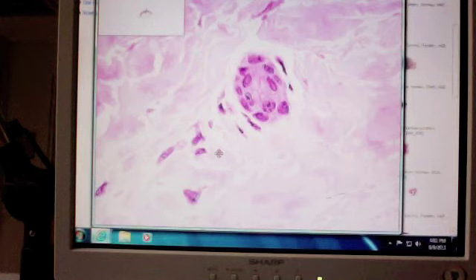Okay. Usually we see these bistratified cuboidal epithelia lining ducts, right? And those are usually ducts from glands of various kinds. If you said gland, would that be wrong? It's not the gland, it's the duct, okay? No, because I asked what is it lining?